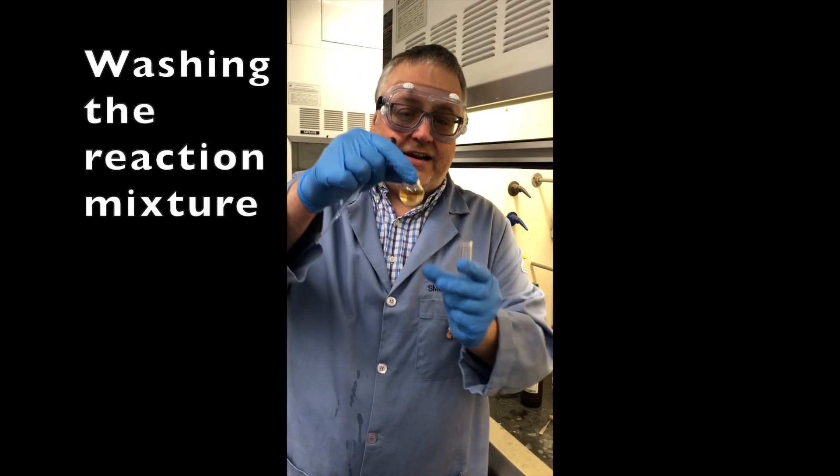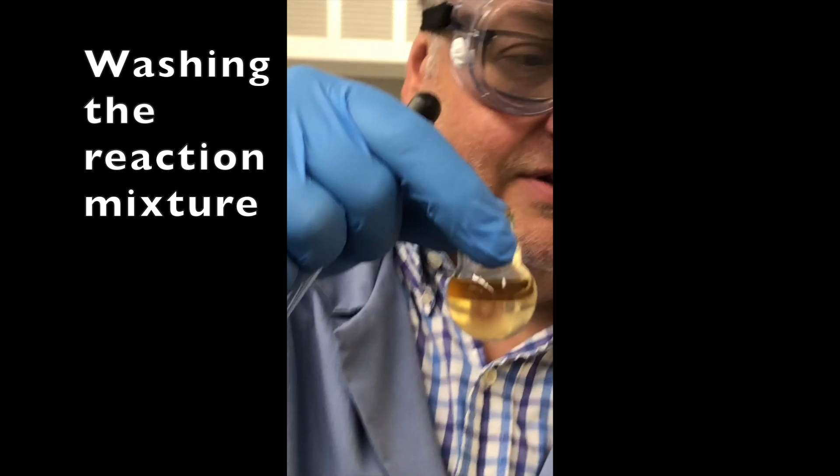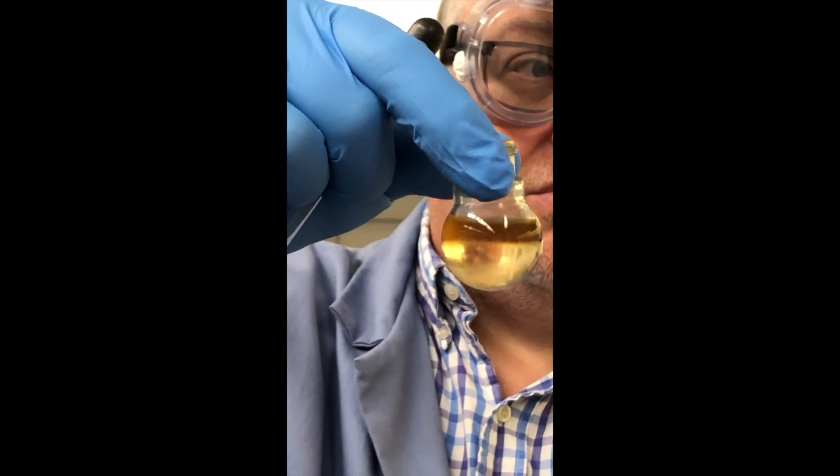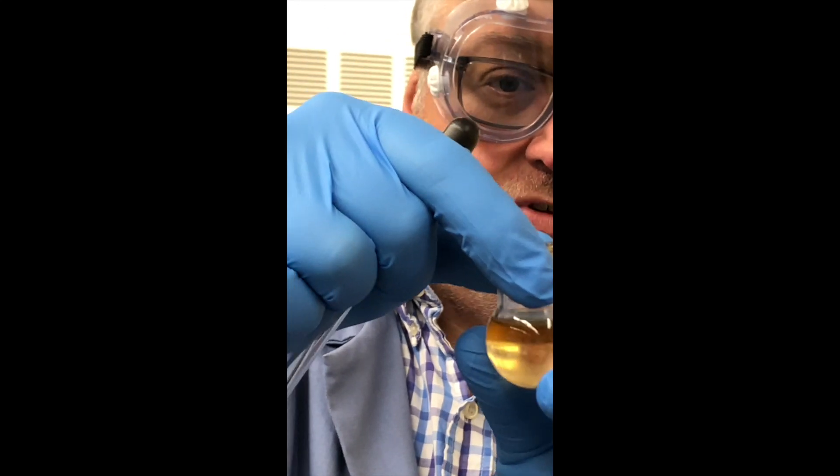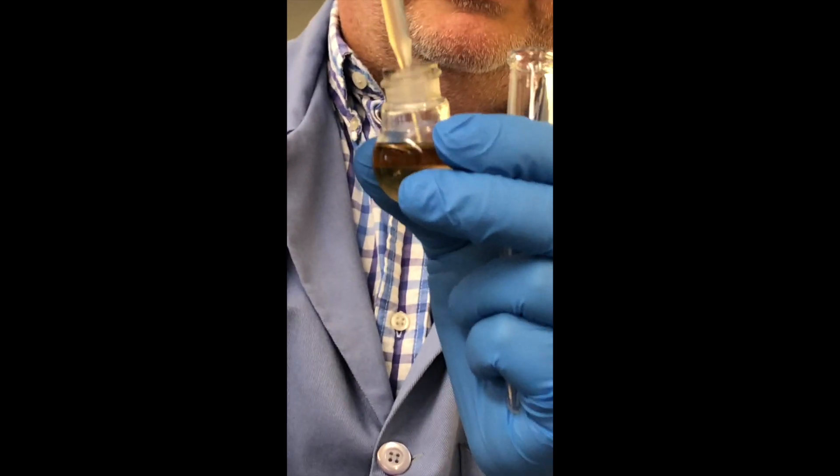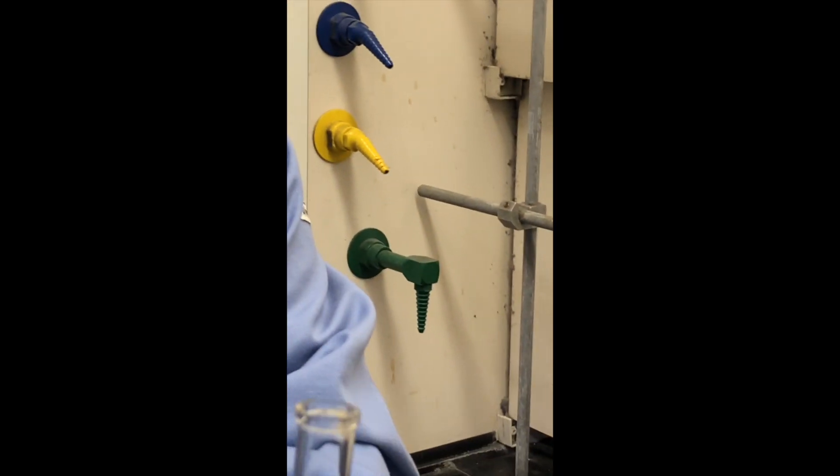We just added five milliliters of water to the final reaction mixture in the tube and it's formed these nice two layers. The upper layer is primarily product with any leftover alcohol and a little bit of acetic acid. So now we're going to transfer this to a centrifuge tube very carefully.